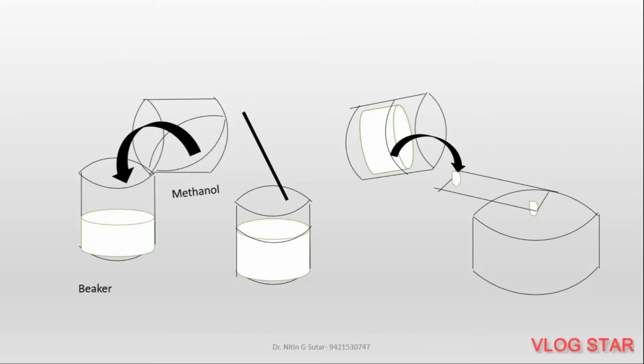Just watch that the solution is spread all over the slide. Just observe how that one drop is spread. In this way, it comes to this side and drains. Again, see, when you pour this, it is drained to this side and comes to this one. In this way, the solution should be spread all over the slide. This is the important one, the slide preparation.